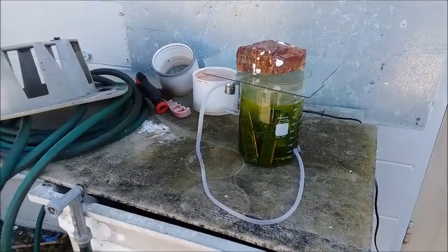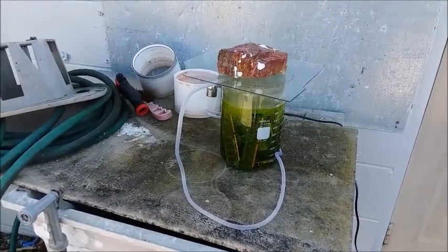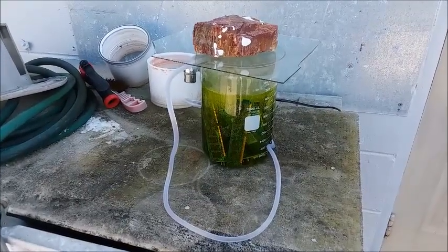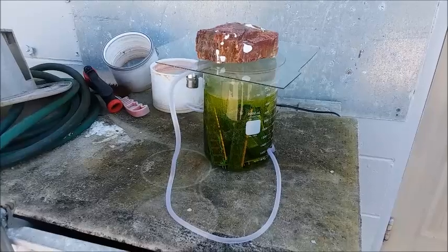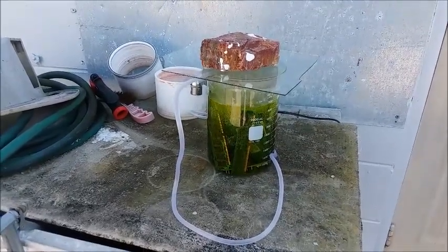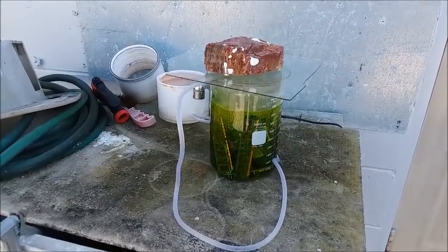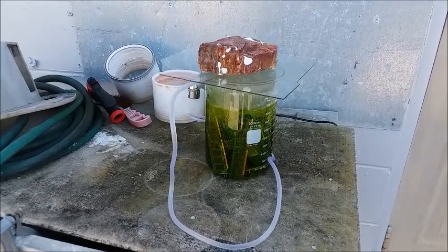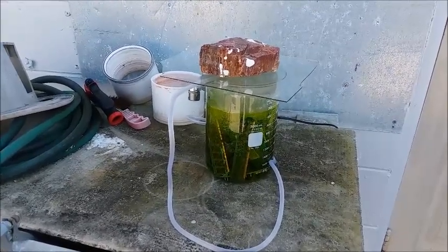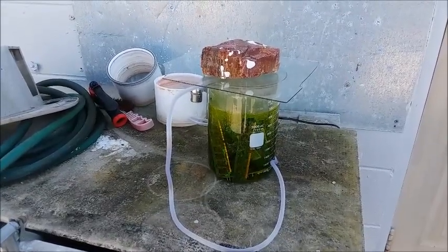Be safe out there guys - and I know you're gonna do it anyway, don't try this at home. Before I forget, the usual disclaimer: dangerous, toxic, corrosive chemicals are being used, poisonous gases are being evolved. This needs to be done outside or in a fume hood. Wear personal protective equipment at all times when handling the chemicals.